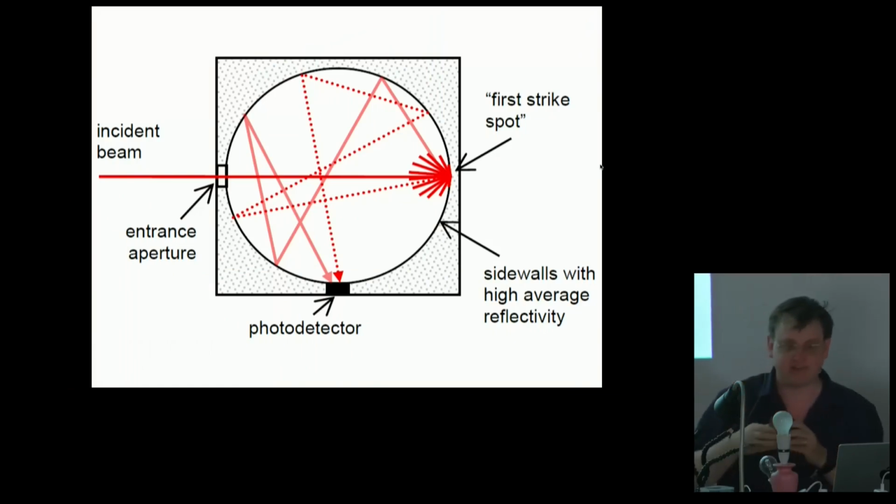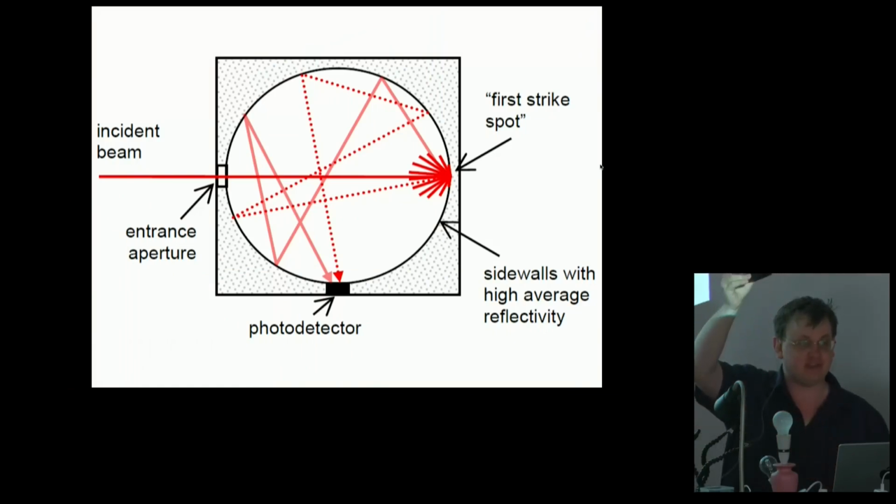So before I demonstrate the next thing, I'm going to get out a little bit of kit called an integrating sphere. This is an integrating sphere. You may notice something about it. It's not spherical. It is actually spherical inside. It's got a spherical cavity inside it, but it's just cuboid, so I can sit it on the desk and it doesn't roll away, which is kind of useful.